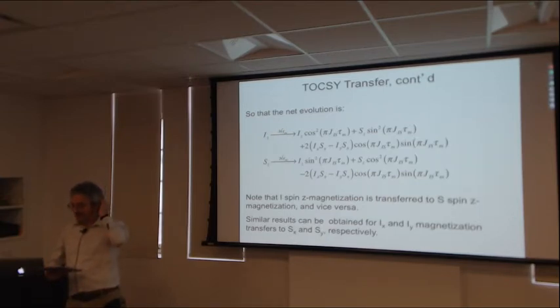For a macromolecule, when we come to talk more about relaxation effects, it turns out that the ROESY cross-relaxation rate is a factor of -2 times the regular NOESY cross-relaxation rate.